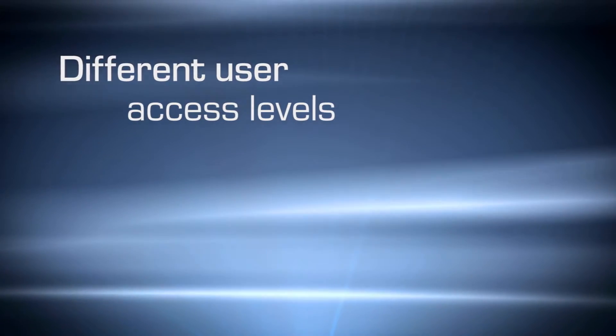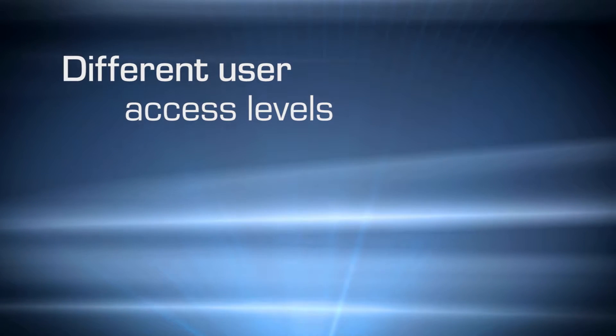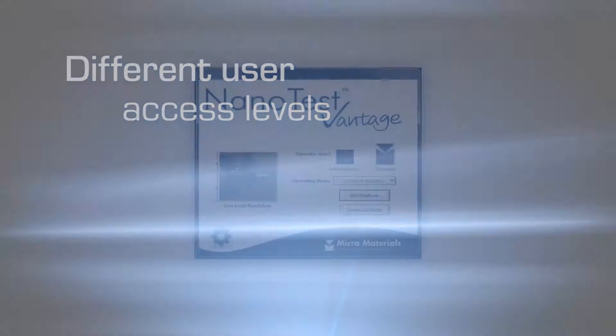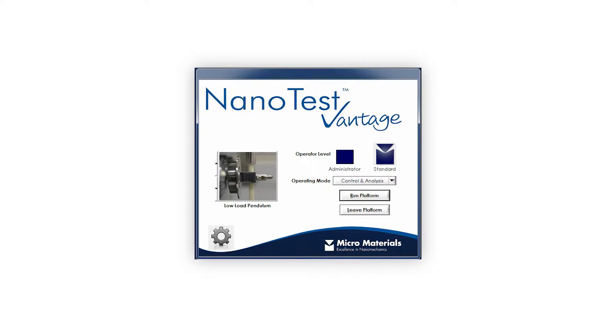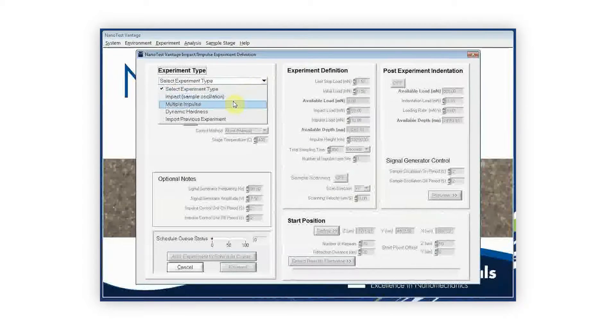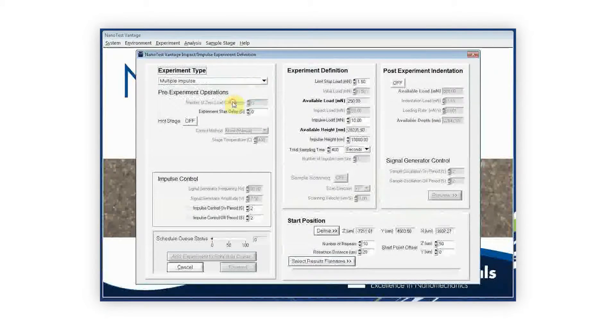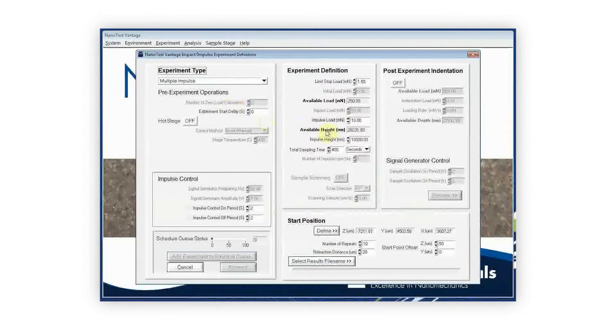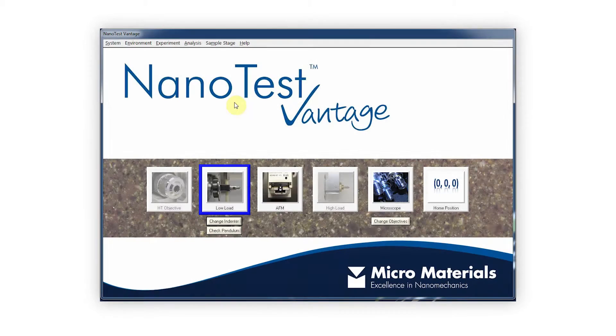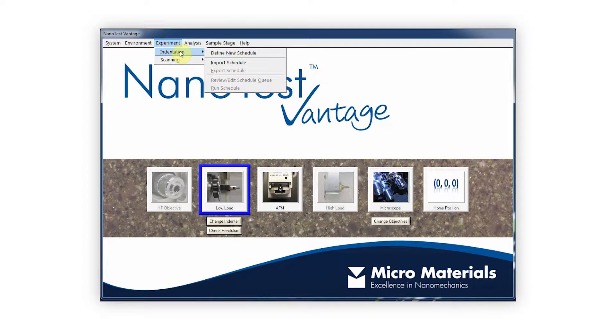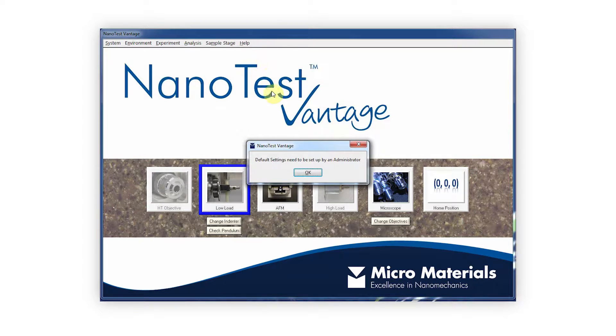The NanoTest platform software has multiple user access levels. Administrators are able to access the full functionality, experiment parameters and calibrations of the system. The operator level offers a simpler, more streamlined form of the software, which is geared towards easy experiment setup and analysis.